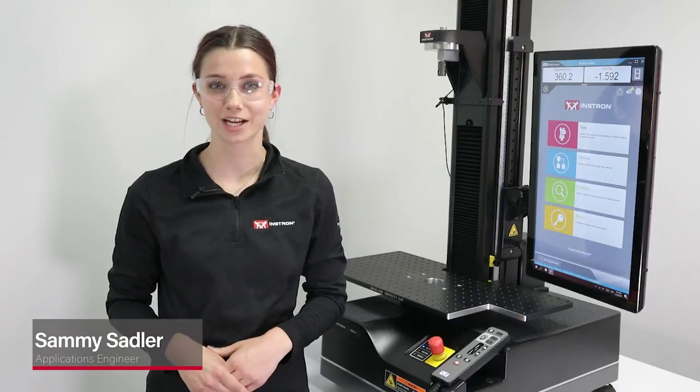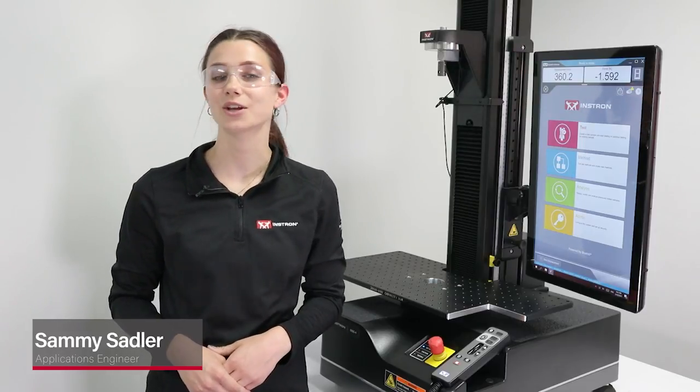I'm Sammy, one of the application engineers at Instron, here to tell you all about it.